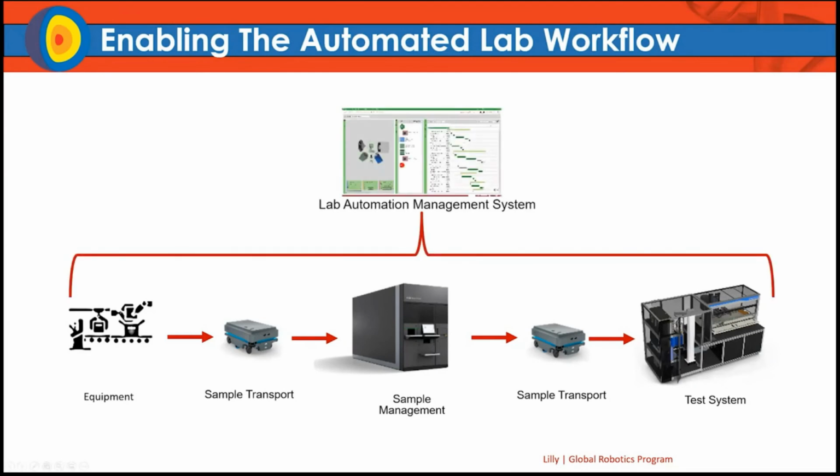Now, in order to choreograph this and ensure that we're driving the most value from our assets, we need some sort of laboratory automation management system. This system will essentially dictate the timing between distinct assets with their own control systems, ensure that the assays are being completed in a timely manner, and that all data is being sent to the correct place. We believe that Biosero has the expertise and that GBG has a unique collection of apps to potentially help us deliver on this vision.